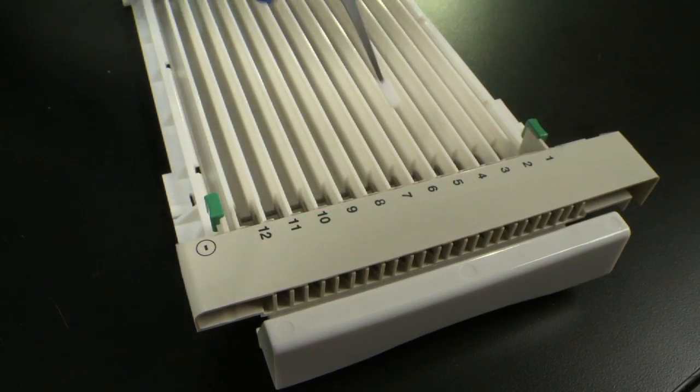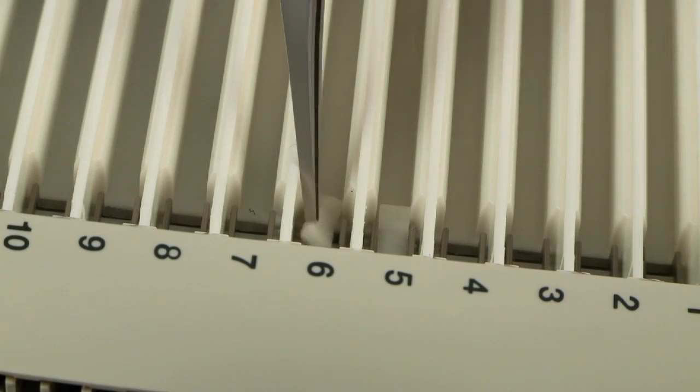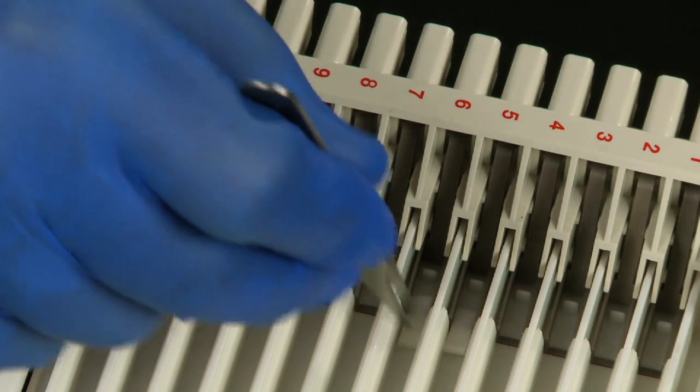At this point, you can add electrode wicks if you choose. Pre-wet the wicks and place them at the ends of the tray.